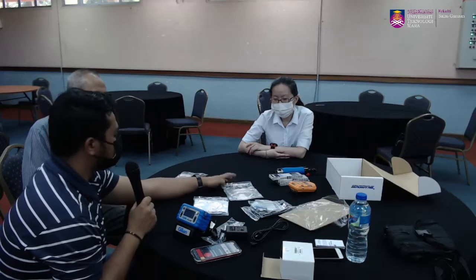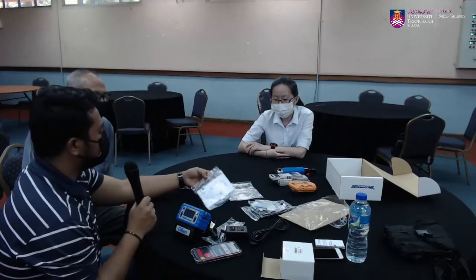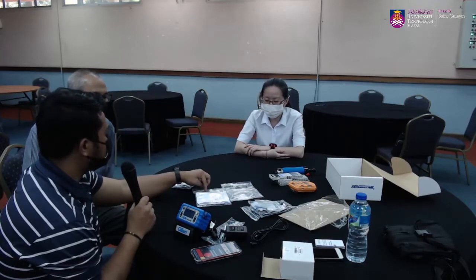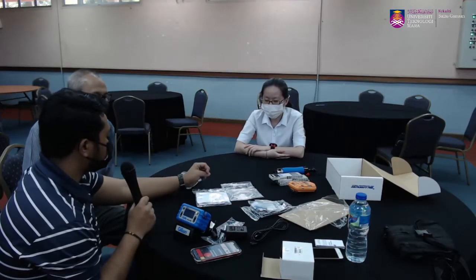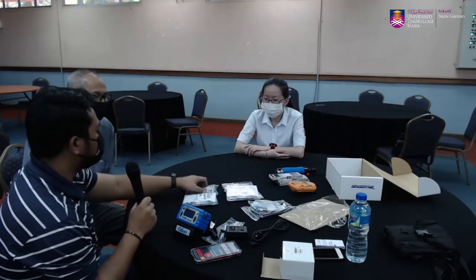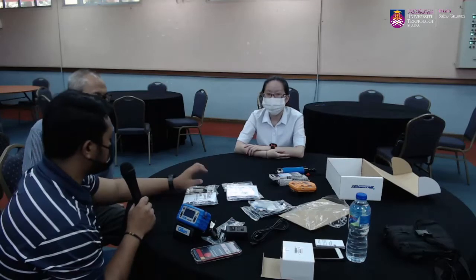Tapi the standard one is this one. And also usually-nya standard untuk cassette semua pakai yang ni, sebab connector bahagian atas dia is similar to any cassettes. Dia semua size yang sama. And then in terms of kita punya cyclone pun memang muat untuk any type of cassette yang kita akan pakai.